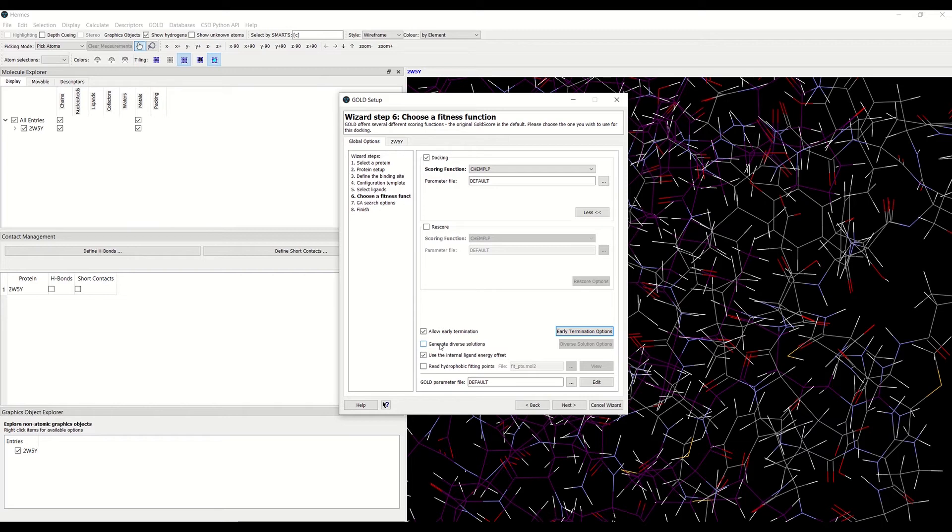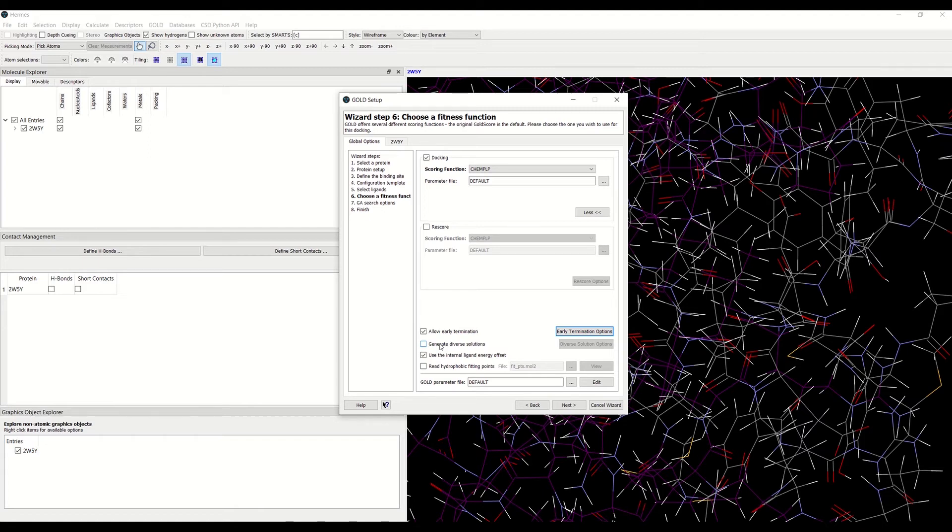If the allow early termination option is activated, GOLD may obtain a user-defined number of ligands within the allowed RMSD very quickly. Although this may not always be a problem, there are occasions when it is apparent that none of the solutions are correct.